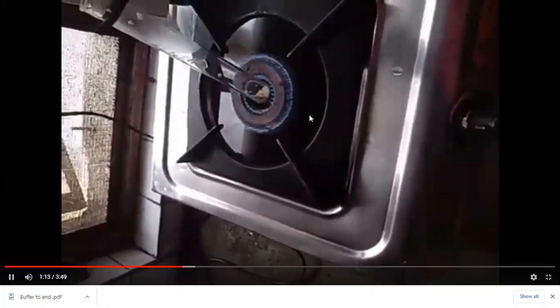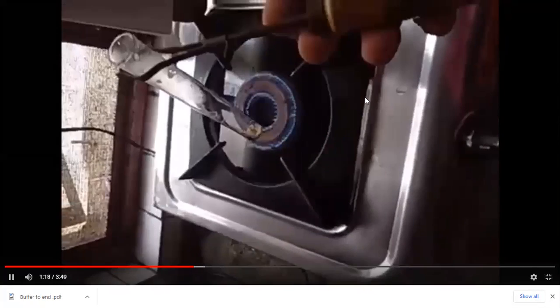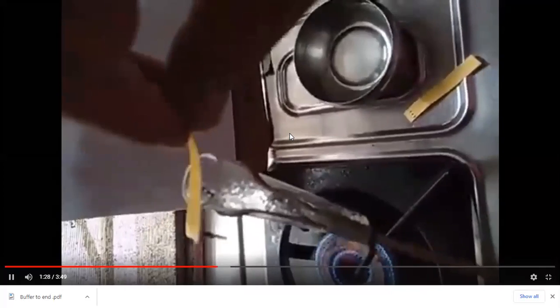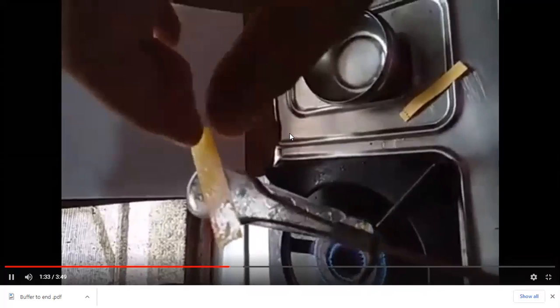So now you can see that the crystals are being heated. We are heating these crystals. See, this is the potassium dichromate paper. That is what I am going to put on the mouth of the test tube, which gives us the idea whether these gases produced are acidic or not.